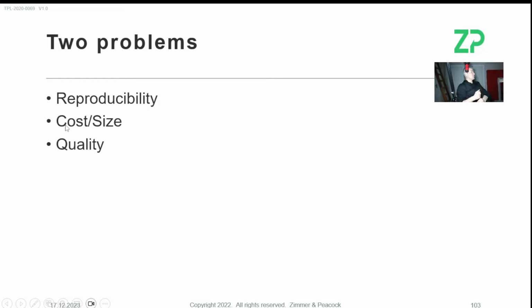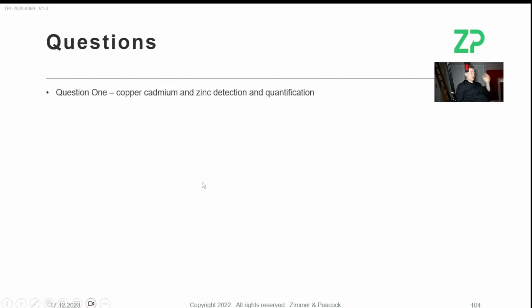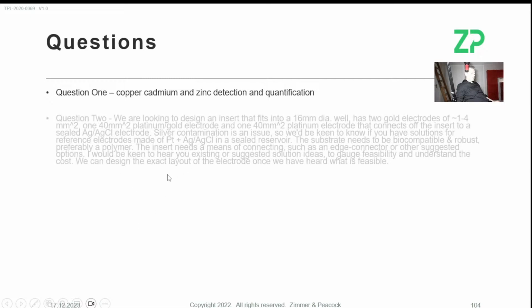Cost is a concern. Platinum is expensive. Whenever you can make an assay work on carbon, always choose carbon. Size is a concern here. 40 millimeters by 10 millimeters will impact cost, and quality is linked to reproducibility as mentioned earlier. So question number 1, the reason I think you've got the extra peaks is because you're in ammonium acetate. When we were doing our work, we were in something that was much more like tap water, because that was the challenge that we were trying to face.